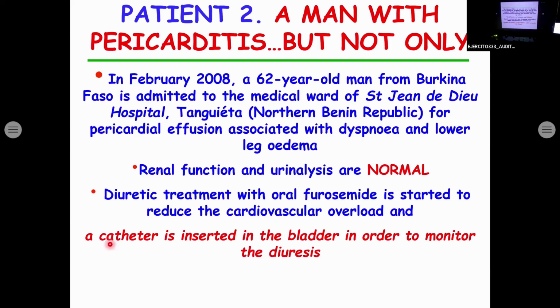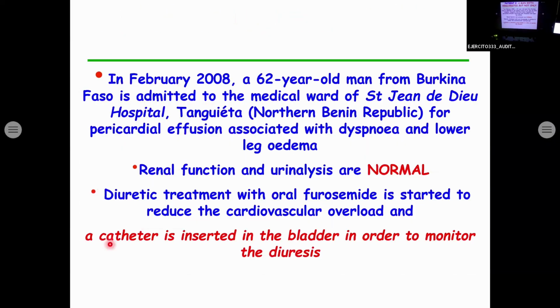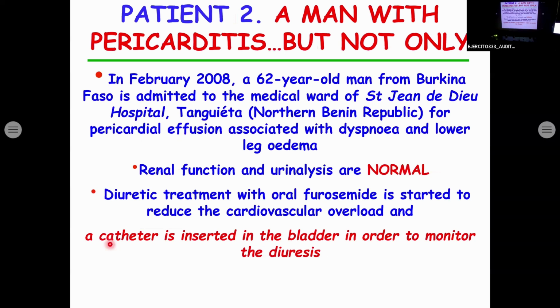Now let me go back. Okay? Patient number 2. A man with pericarditis, but not only. In February 2008, a 62-year-old man from Burkina Faso.